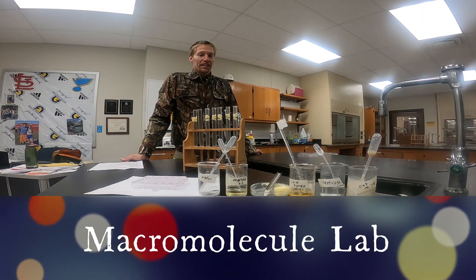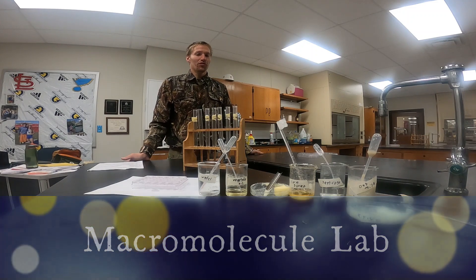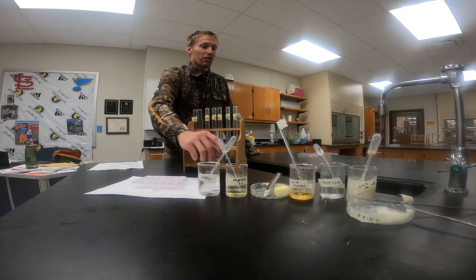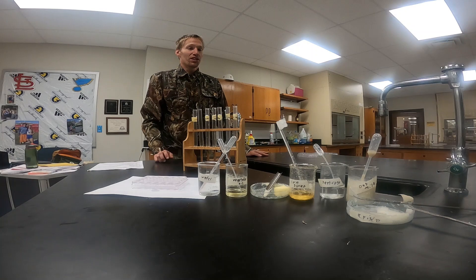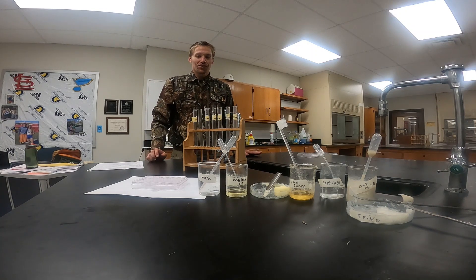Hello, and today we're going to be doing a lab looking at what macromolecules are found in some different food substances. Today we're going to be using water, vegetable oil, butter, corn syrup, dextrose or a sugar solution, oatmeal, and Crisco as our test solutions.